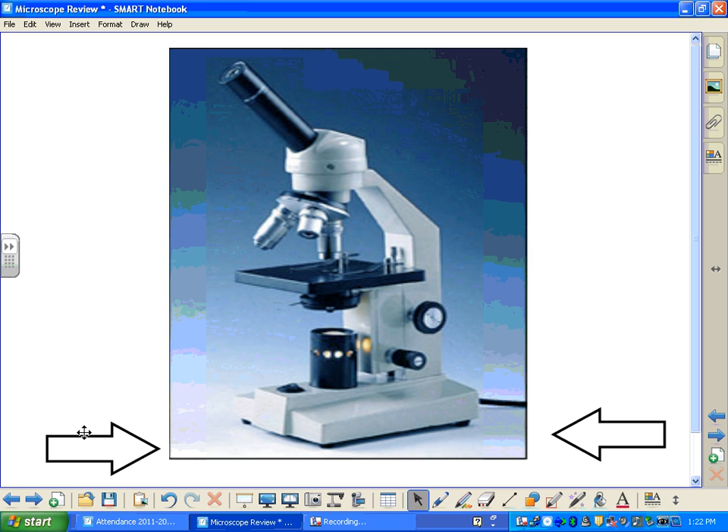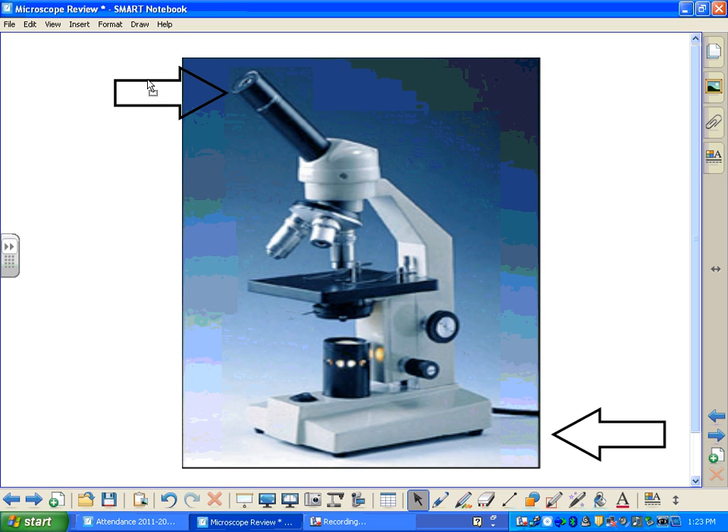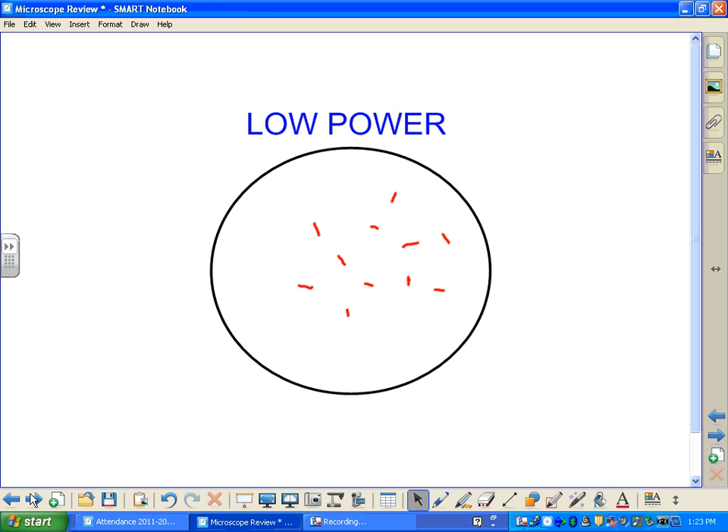To start, we're going to lower the stage as far as it will go and make sure that we're on low power. Then we can place our slide on the stage. Then we're going to raise the stage as high as it will go and look through our eyepiece. You may or may not be able to see your specimen — if your stage is raised all the way, you have a very good chance of seeing it. In this case, we have some small microorganisms seen here under low power.